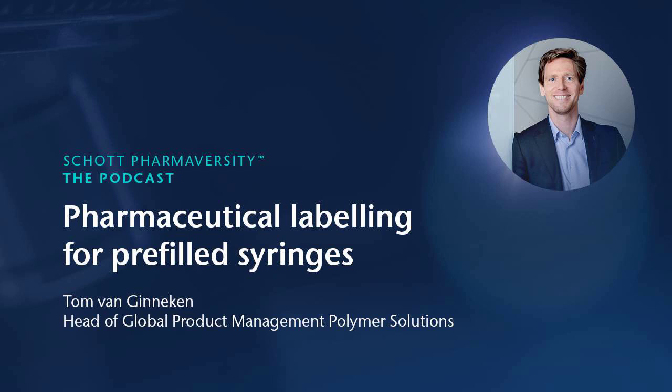Yeah, well, there was one more thing that you mentioned at the beginning, and I think it was the topic of tamper evidence. So to me, it's not yet clear what exactly it means in the context of primary packaging. So tamper evidence, when is it used? Why is that relevant? That would be something where I think a deeper look would be worth it. So it would be great if you can give us some additional information here as well.